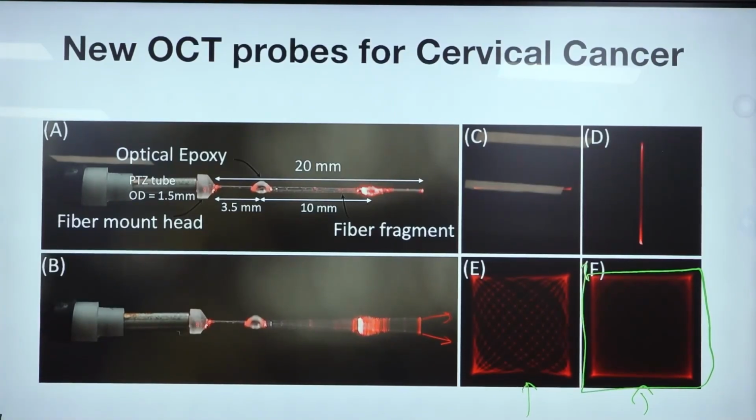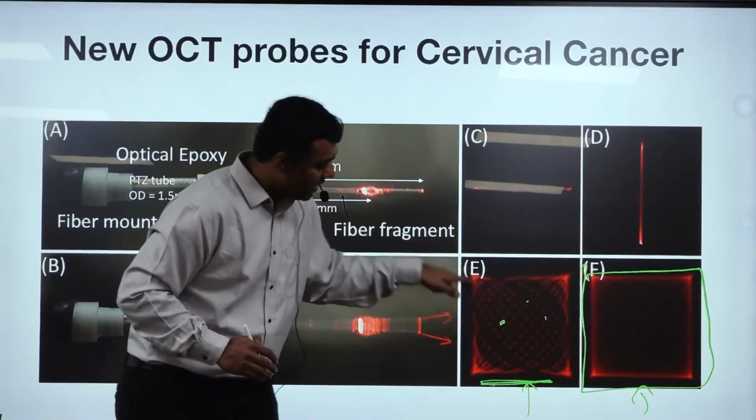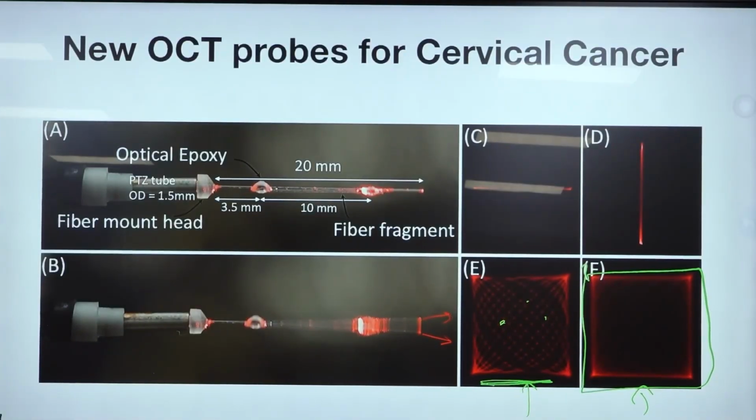But somewhere in between, it looks like this, where there are gaps in here. Can everyone see this? So the patterns are here, and then there are gaps here. What this means is that if you had a regular raster scan, and let's say the entire scan takes 1 second, after 0.3 seconds it will cover only a small area, then 0.4 seconds and 0.5 seconds and so on. It will cover the area linearly.